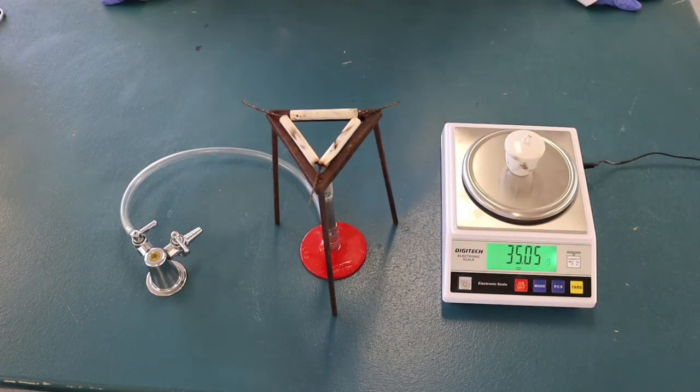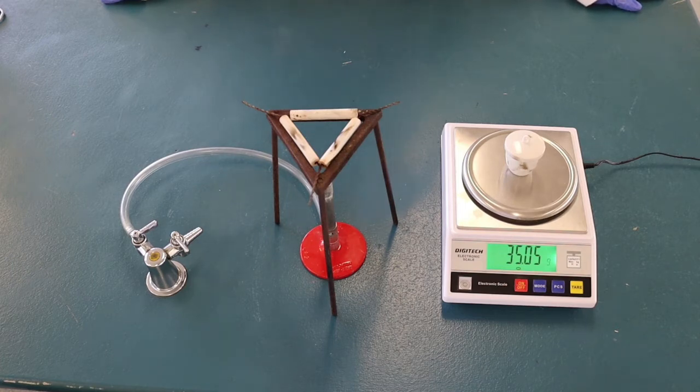Place the crucible on a pipe clay triangle on a tripod over the Bunsen burner and carefully heat the crucible until the magnesium begins to glow.